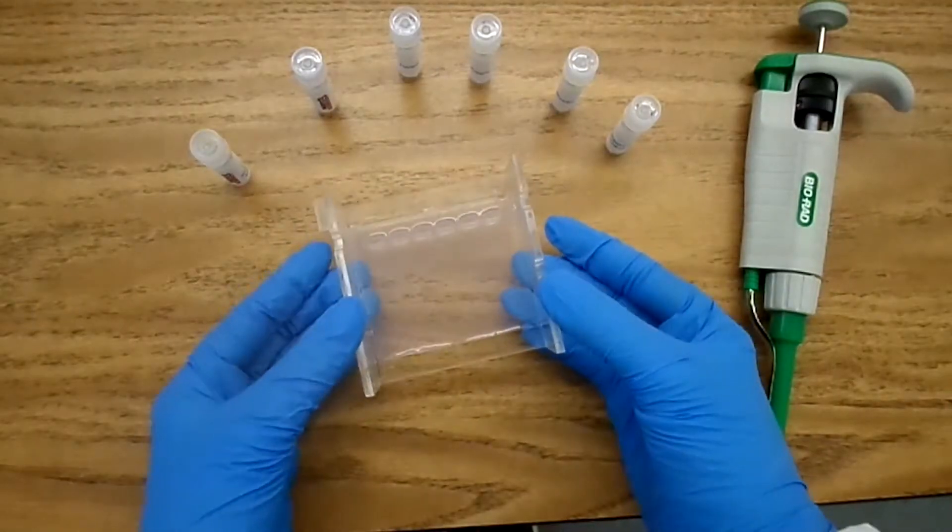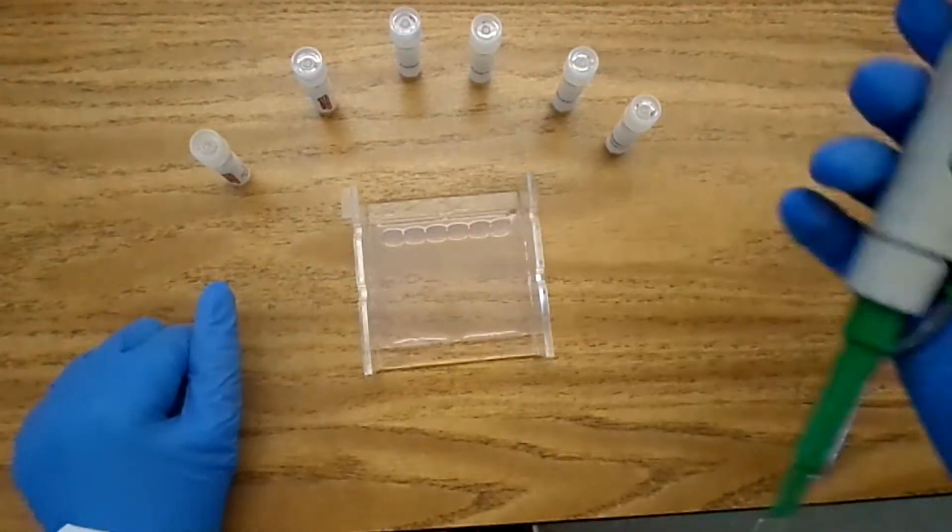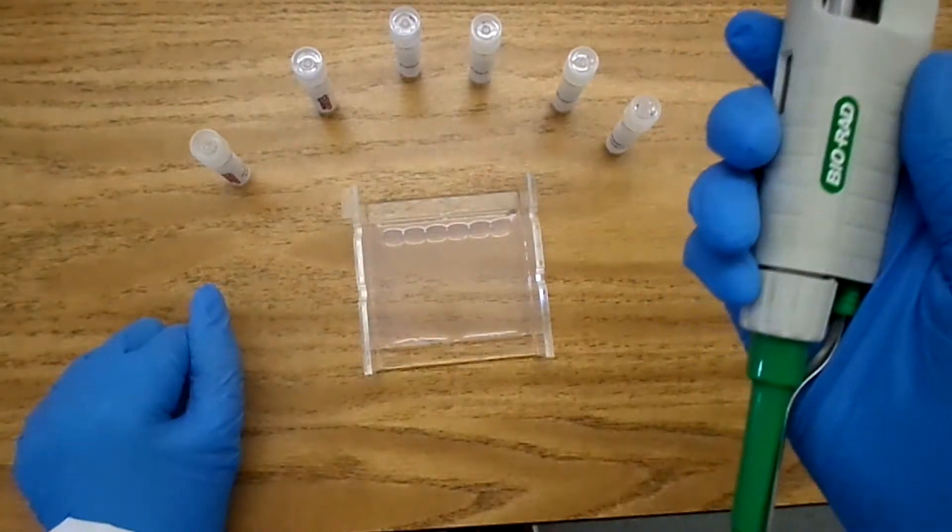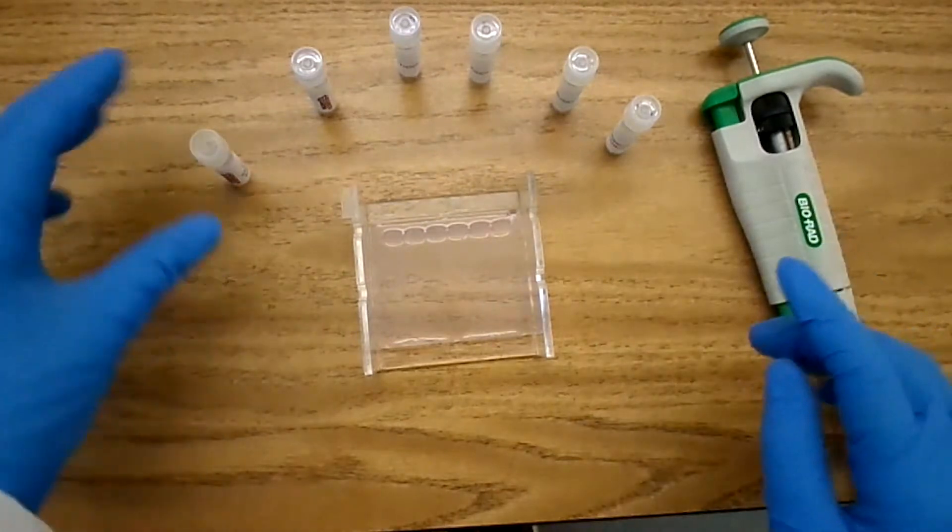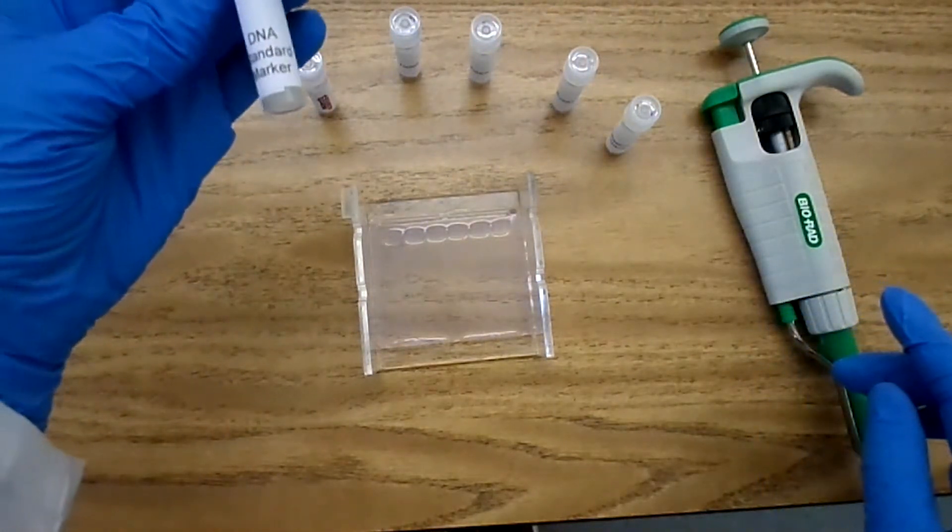This is our gel for the gel electrophoresis. We're going to be using a micropipette to load 10 microliters of each sample into the corresponding well. We'll start with the DNA standard marker.